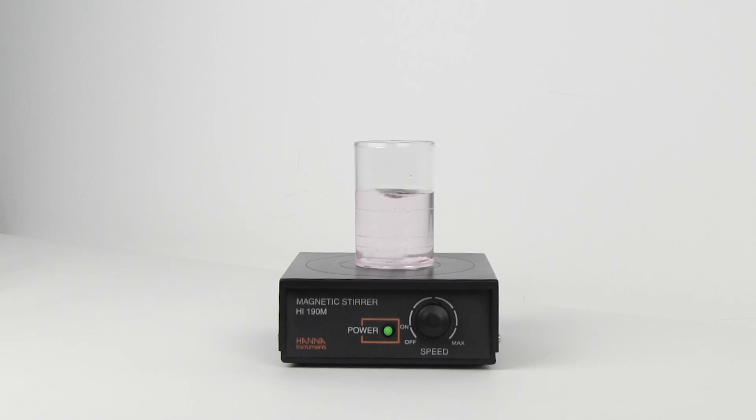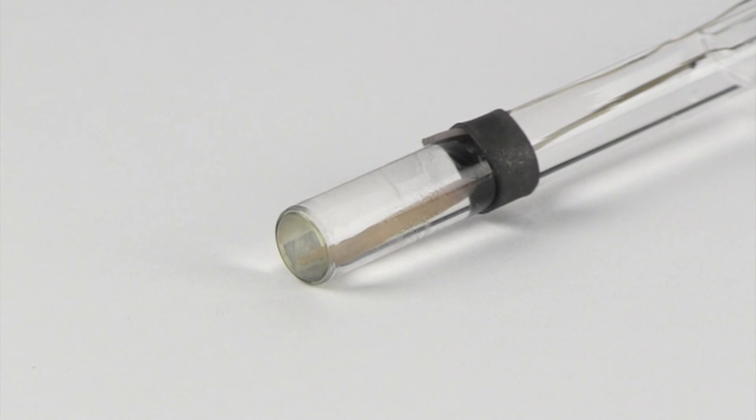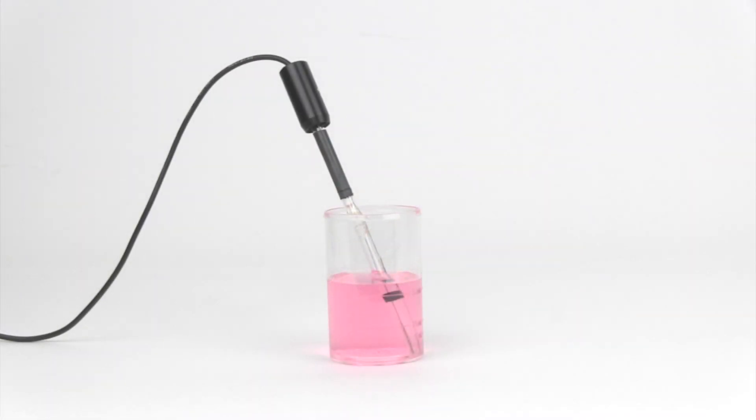It is important to note that if the sensor has been shipped or stored dry, then the electrode will require conditioning prior to performing the slope check. To condition the electrode, soak it in one of the buffer solutions for at least one hour.